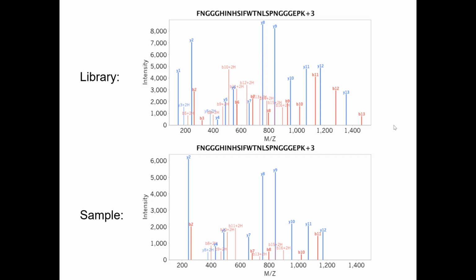So you get arginine, lysine, and then another 20 times that is 40. So 1 out of 40 peptides will have Y2. So Y2 really isn't necessarily a very good signature for this, even if we see a high measurement for it. Does that kind of make sense? You guys get that?